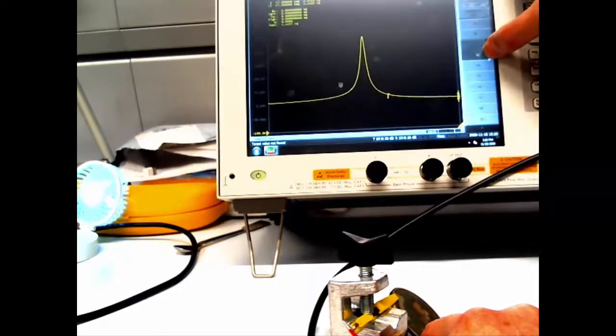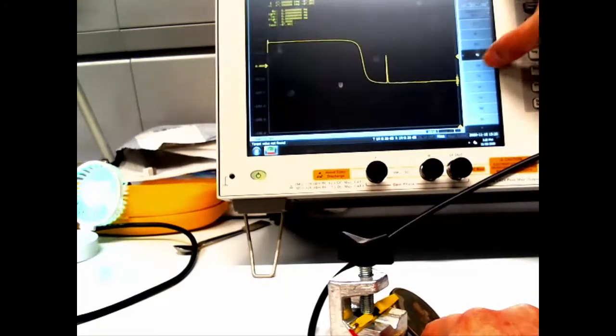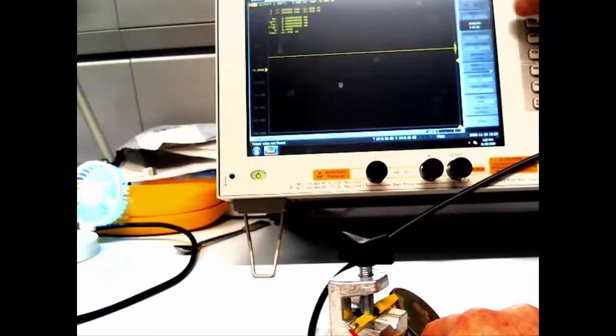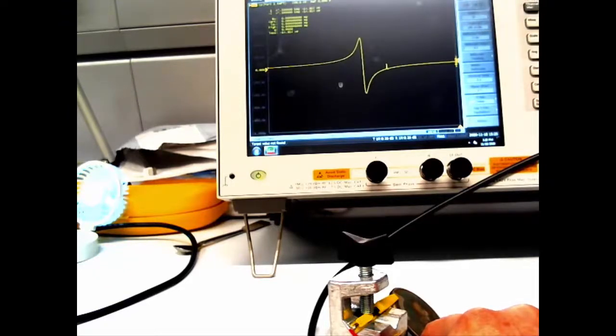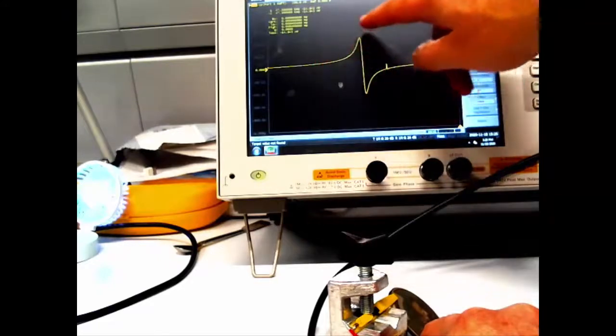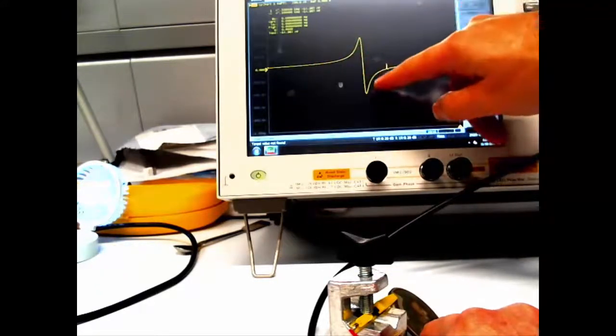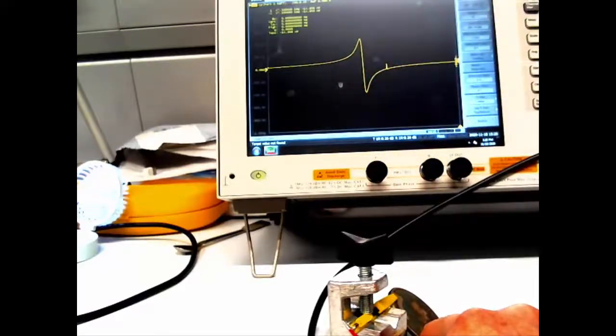If we go back, we can also change and see some other things, but these are all related to each other. There aren't actually that many different things in there. So that is one that's a fairly standard peak where it's shifting in one direction on one side and the other direction on the other side. Effectively it's the derivative of the last curve we saw. Okay, so that's what we would see.